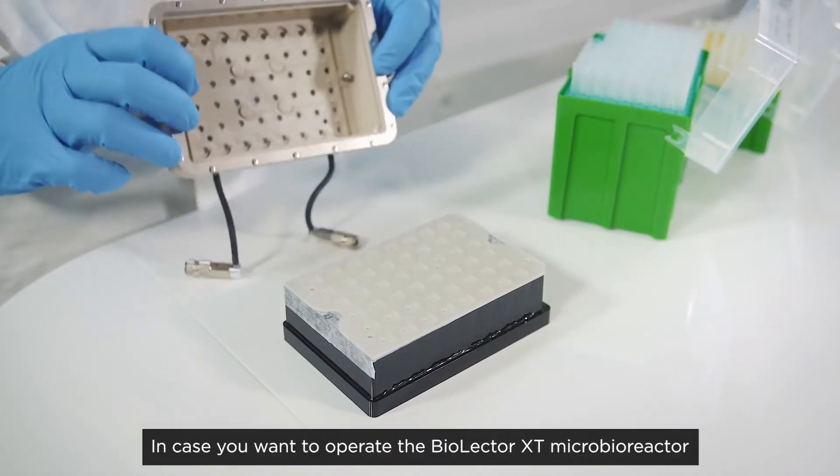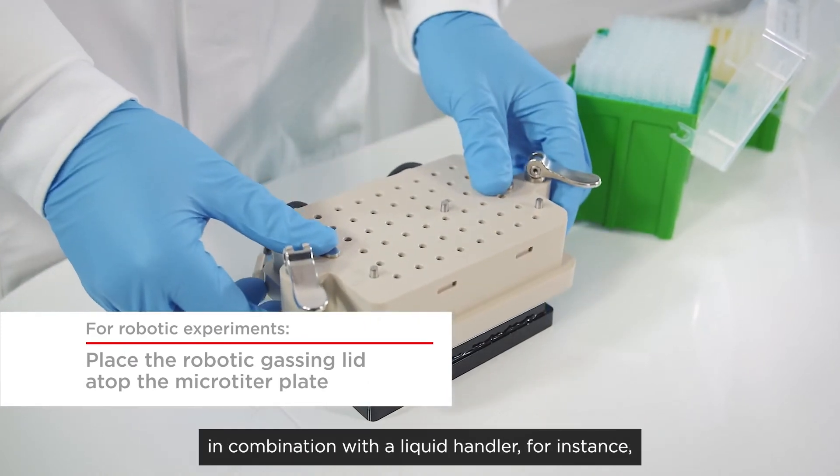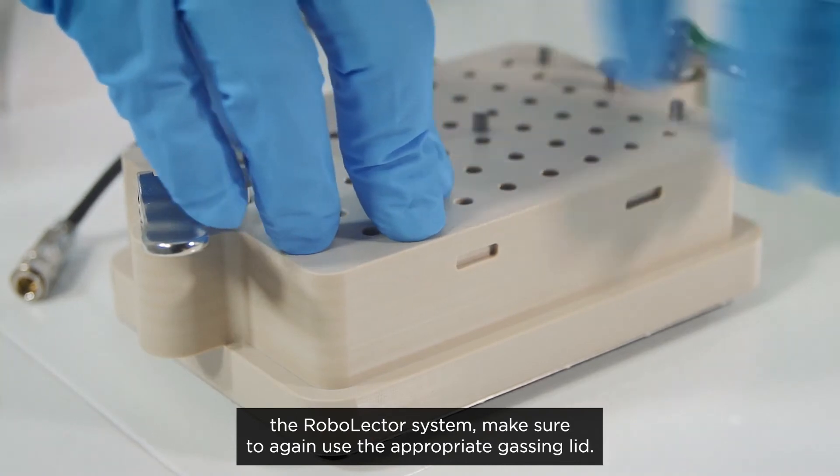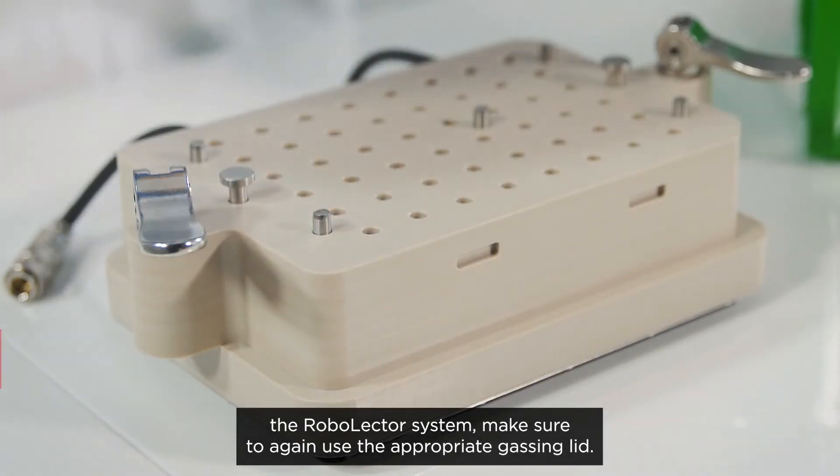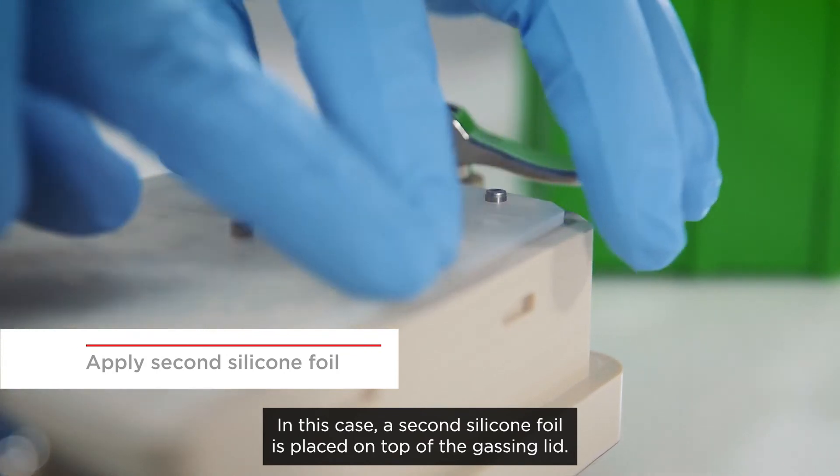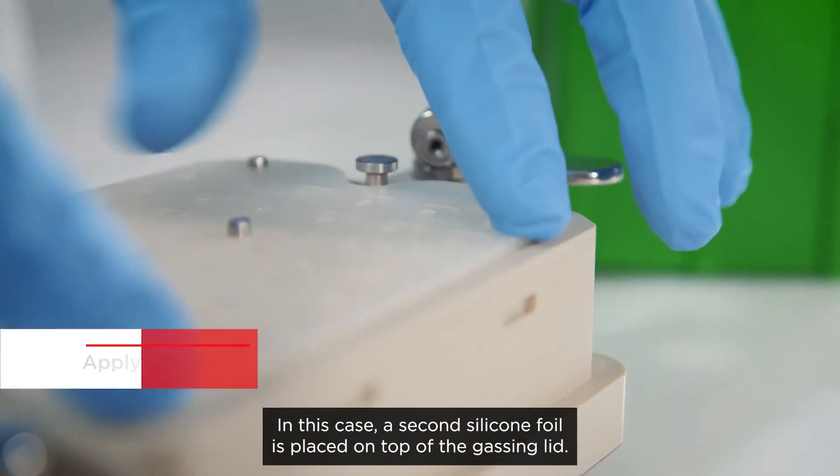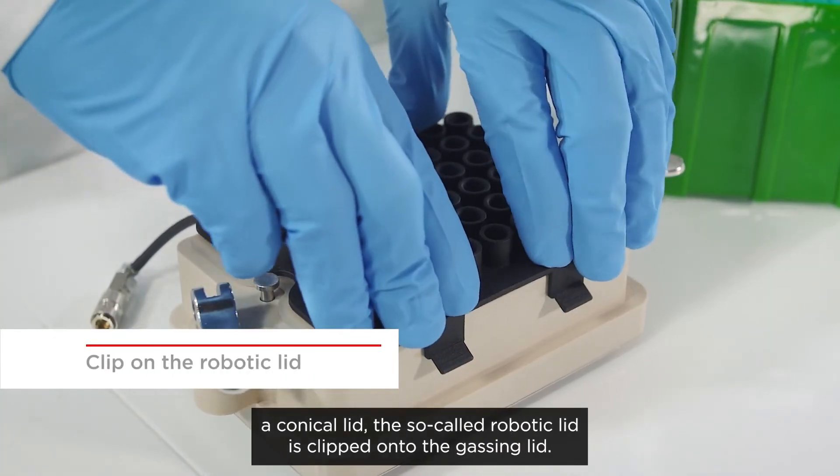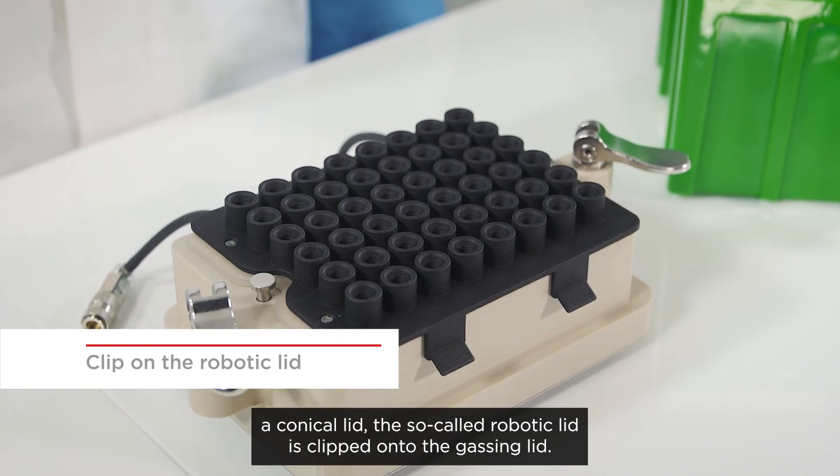In case you want to operate the BioLector XT Microbioreactor in combination with a liquid handler, for instance the RoboLector system, make sure to use the appropriate gassing lid. In this case, a second silicone foil is placed on top of the gassing lid. For guiding the liquid handler's pipetting needles, a conical lid, the so-called robotic lid, is clipped onto the gassing lid.